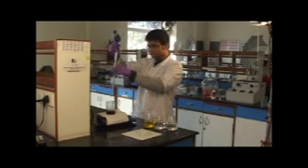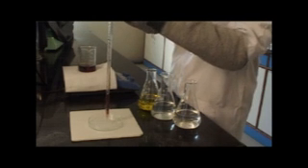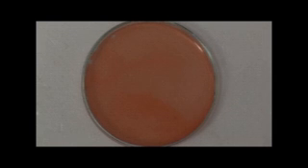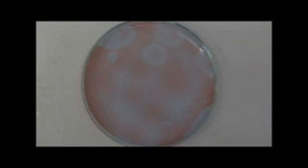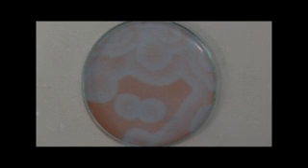Now let's put a thin layer of the solution in a petri dish and leave it undisturbed for a few minutes. We see the evolution of blue dots that become rings of red and blue. Soon, the whole petri dish is covered with patterns. The reaction has two main parts. First, the autocatalytic oxidation of cerium by potassium bromate, followed by the reduction of cerium by malonic acid and its bromoderivatives, which are produced during the overall reaction.